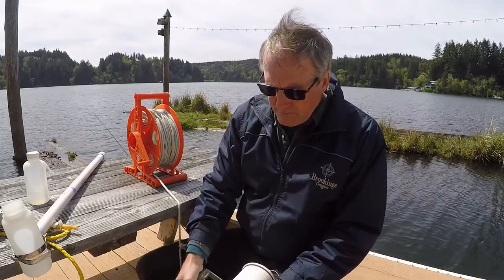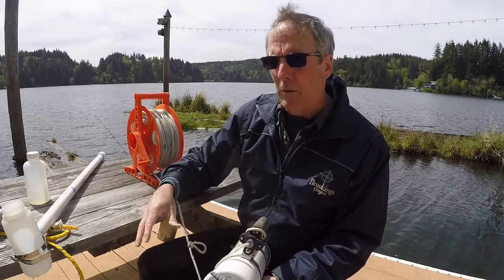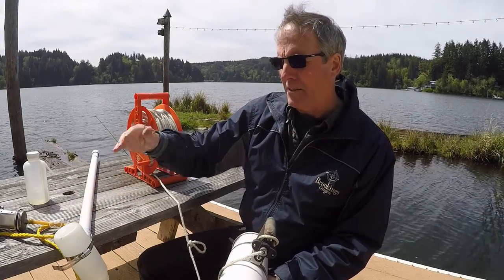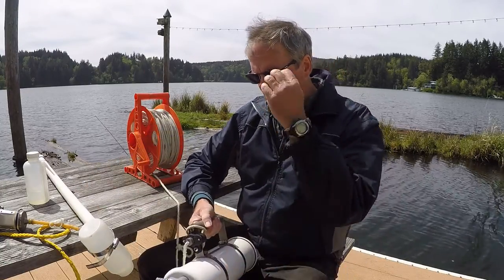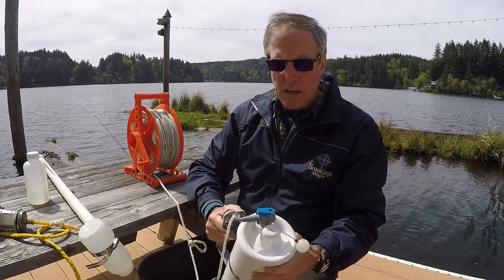So if we had just a bottle like that and we lowered it down, of course it would fill up as soon as we got it in the water. There's really not a real good method for keeping the bottle empty until it gets to the bottom of the lake. So the Van Dorn bottle sort of solves that problem.